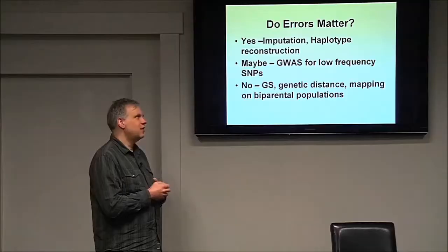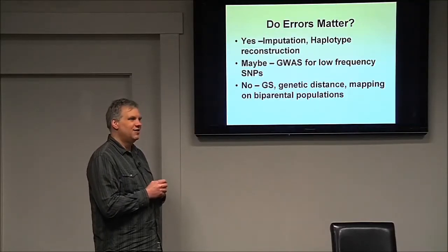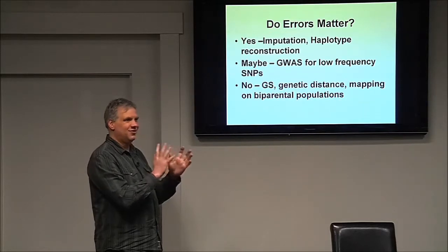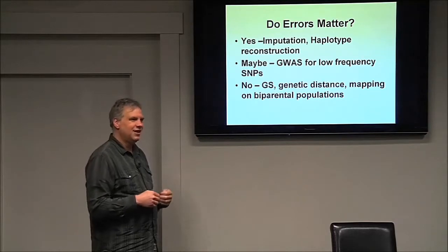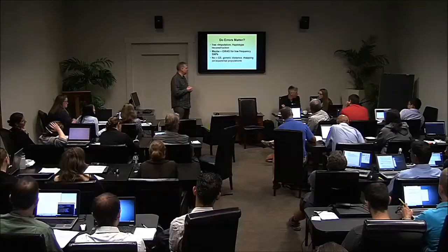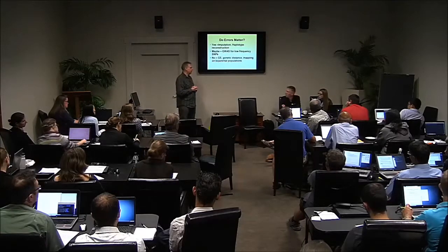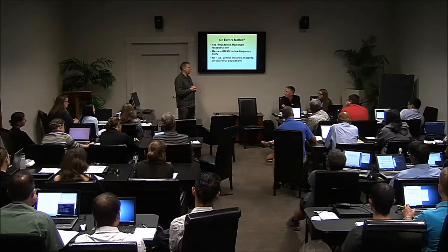The problem was that if those are errors, then you basically can't use that tag anymore. And we wanted to be able to call the SNPs within them so that the good SNP is still useful, and we still get the depth on the good SNP across multiple tags that aren't even necessarily the same, if that makes sense. With your logging output in the current SNP caller, you have locus information, so you could use that to easily stitch together those haplotypes, right?